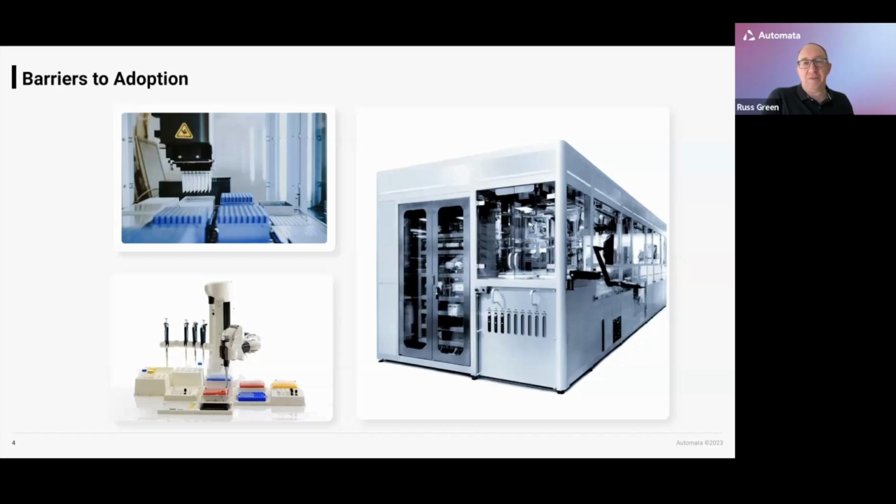Just representative of something massive. And some automation might be huge. You might need to be significant in size and scale to achieve the goals that you want to set out to, but it certainly doesn't need to be that way. And I certainly wouldn't recommend that scale of automation to be your entry point into this world either. I think it's far more amenable to people to start off with something a little bit smaller and move on.